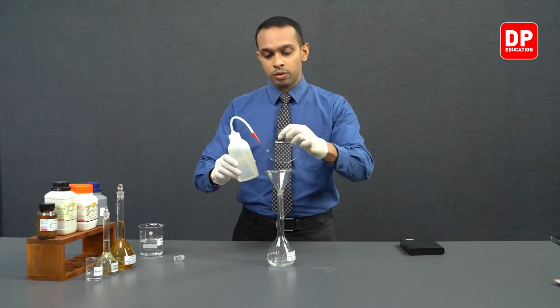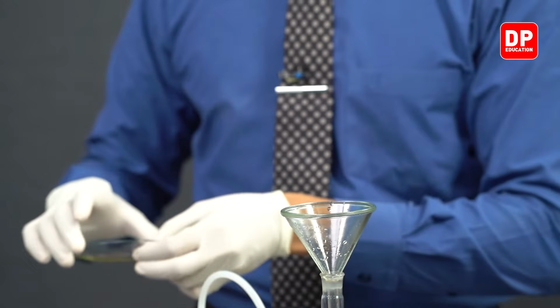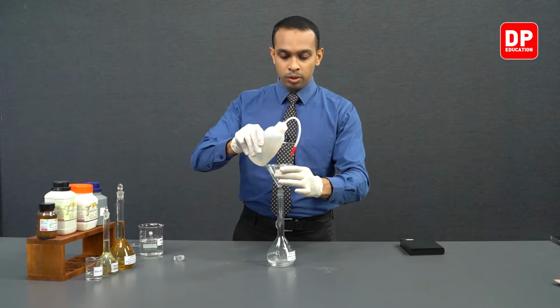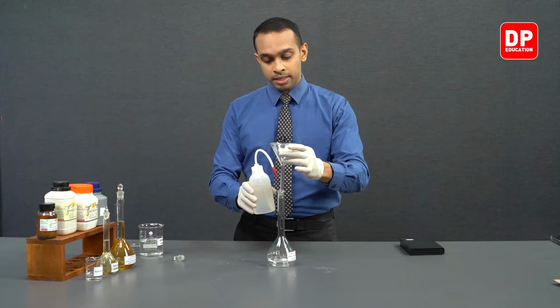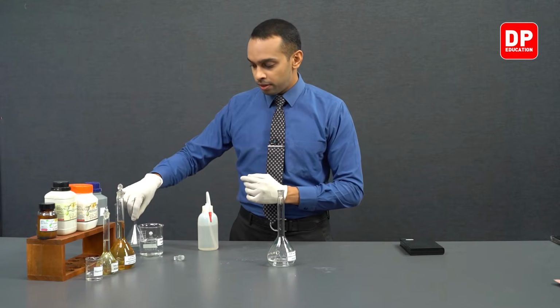We can turn the watch glass upside down as well and wash the bottom bits of the watch glass as well. And then we can wash the inner walls of the funnel as well as the tip of the funnel. Then we can keep the funnel aside.